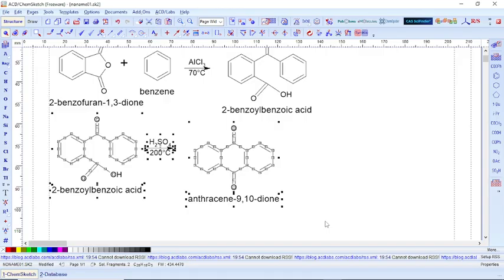So what you just do is highlight the last reaction, this last one, highlight it, then come up. You see this place? What is it called? If you have seen my screen, I don't know if you can see it.